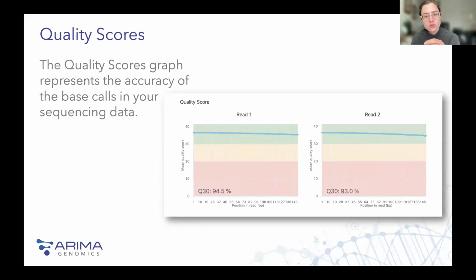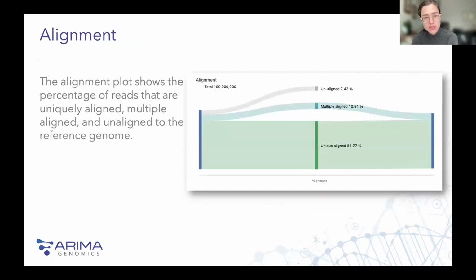So we saw the different sections that Ibrahim demonstrated for us. I just wanted to mention a little bit more deeply what these sections represent. The quality scores are the traditional Illumina quality score, the Q30, right? Is that what you mostly want to see for your reads? As long as your reads are in the green, maybe yellow region towards the end of the read, you're fine. Ideally, this would be above, let's say, 90%.